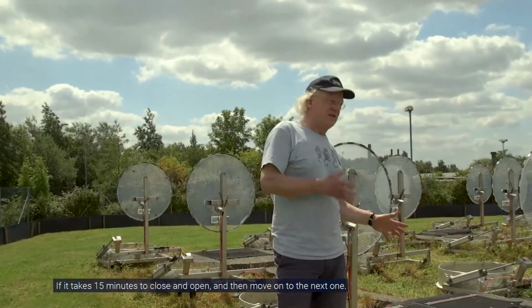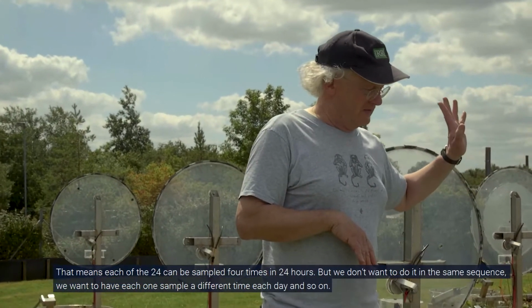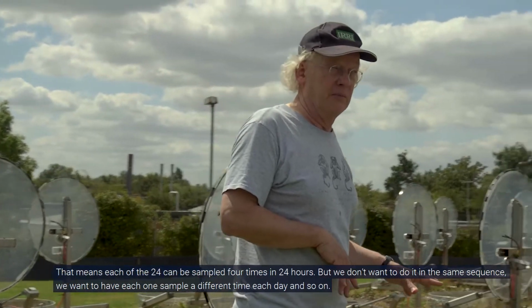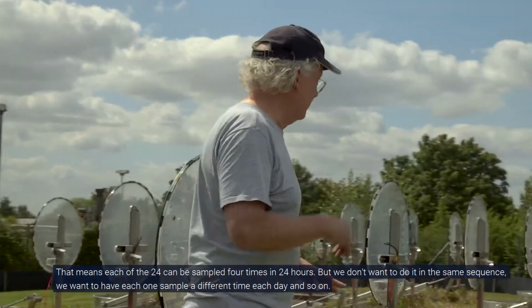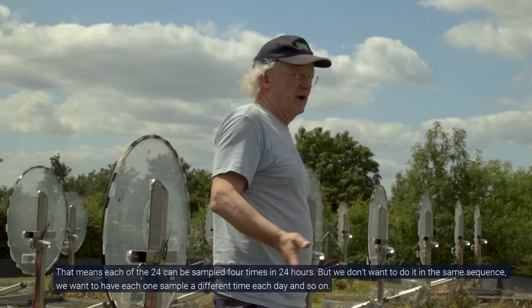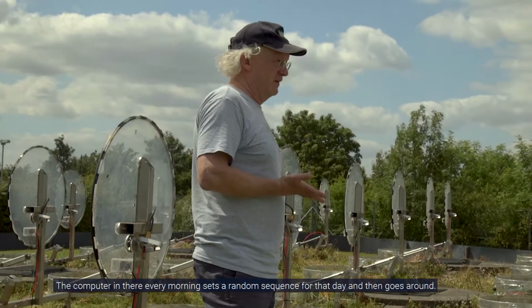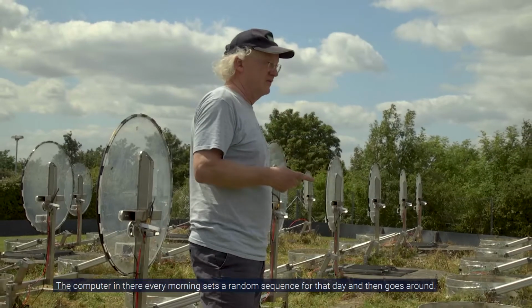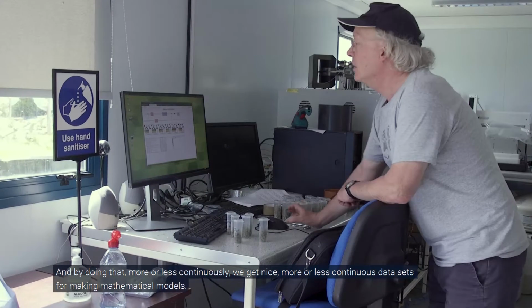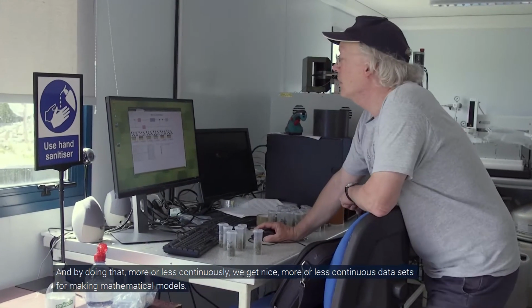If it takes 15 minutes to close and open and then move on to the next one, that means each of the 24 can be sampled 4 times in 24 hours. But we don't want to do it in the same sequence. We want to have each one sampled at a different time each day and so on. So the computer in there every morning sets a random sequence for that day and then goes around. And by doing that more or less continuously, we get nice, more or less continuous data sets for making mathematical models.